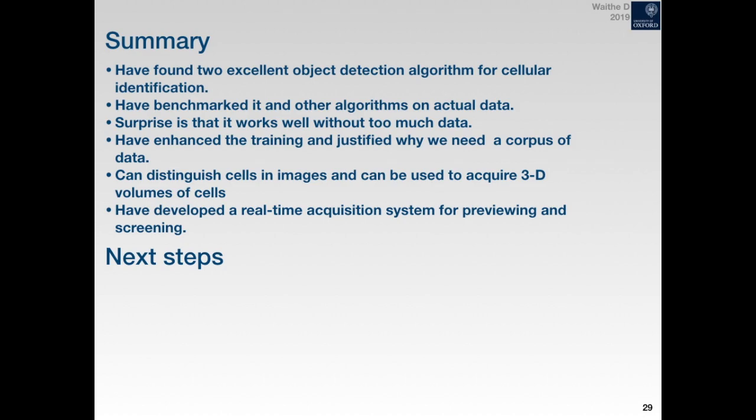So we're democratizing the technique as much as possible, and you can use it for screening your cells, but you will also potentially be able to use it for recognizing cells that are going through a certain cell cycle or something like that, and do imaging pipelines that react dynamically to certain appearances of your cell.